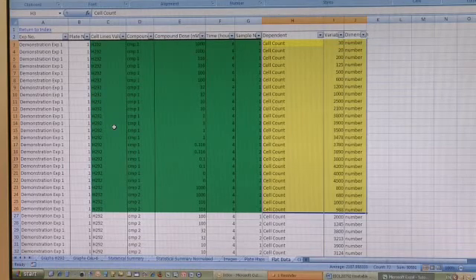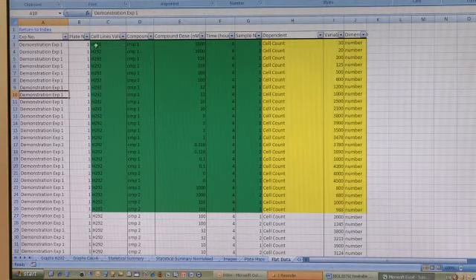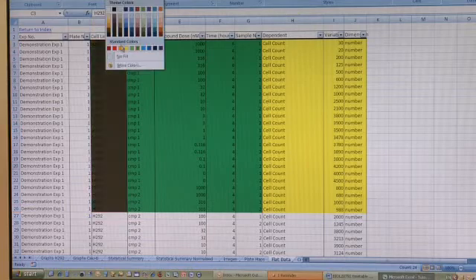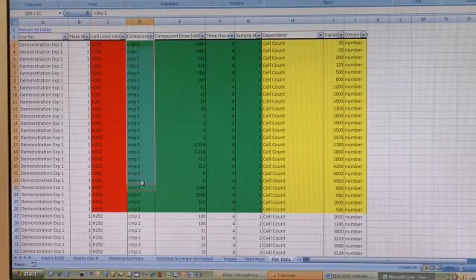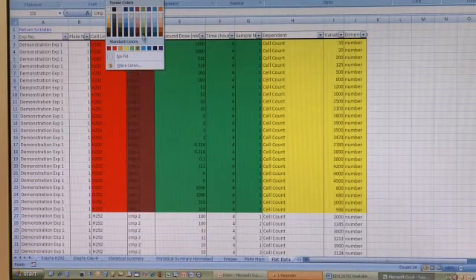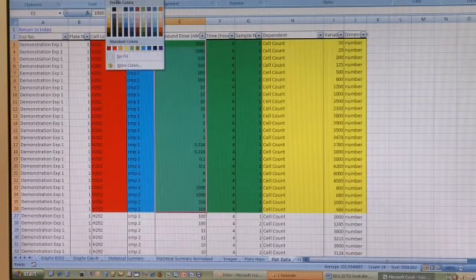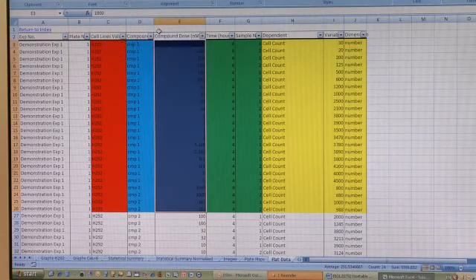No matter how many independent variables there are, each is coded within a separate column. So here we have cell line, compound variable, dose variables, and so on, with each measured variable occupying a series of rows.